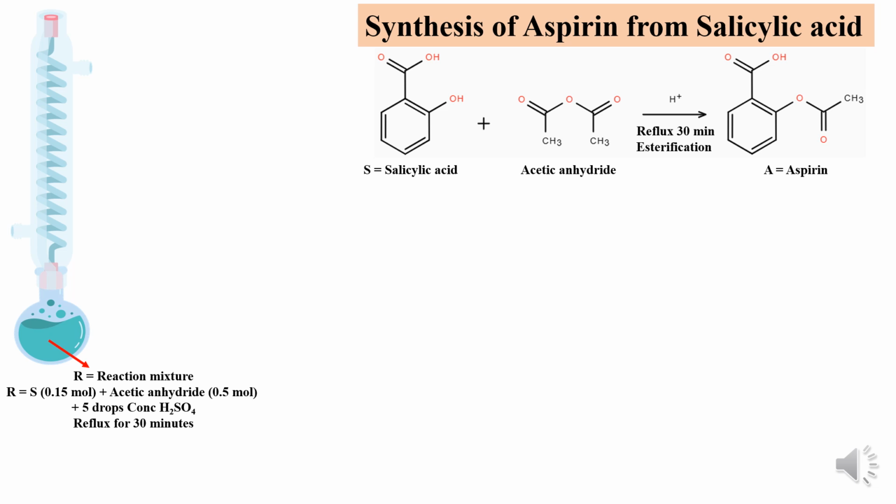After the completion of the reaction time, you have to work up the chemical reaction. Now the workup procedure is not a purification procedure. In fact, it is a procedure that is meant for the isolation of the product from the reaction mixture. And this is how we are supposed to carry out the workup procedure for the isolation of aspirin from the reaction mixture.